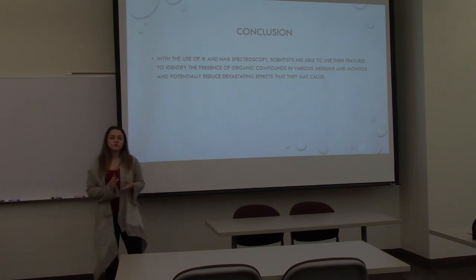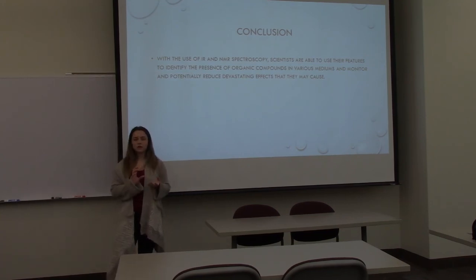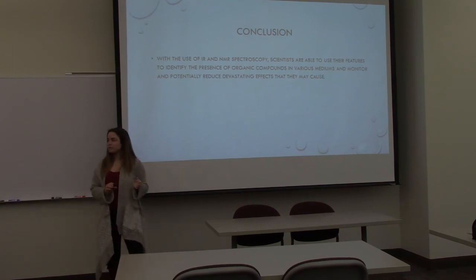So in conclusion, with the use of the IR and NMR, we're able to detect some compounds that can be found in surface water or other mediums, and we would be able to monitor and potentially reduce the devastating effects that they would cause.